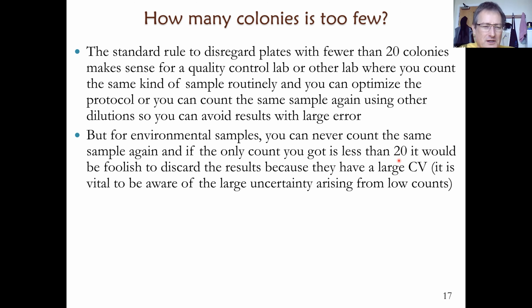Remember, if you're publishing figures like this, don't give too many significant figures. We have only had a count of 418. We have a standard deviation of about 0.1. So it's not justified to give more than two significant figures. And that's very rarely the case, that you have more than two significant figures. Often, in some cases, maybe less than two. So a couple of remarks.